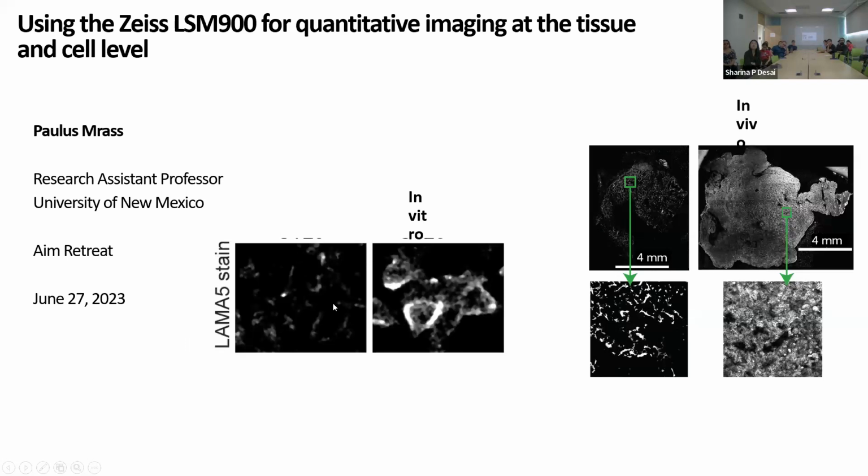So I don't know, this image maybe doesn't look great, but it's a higher magnification. I captured it with lower magnification. And I just wanted to look at the expression level of something. And even with this relatively low resolution, I got a clear result because there is actually a big difference.